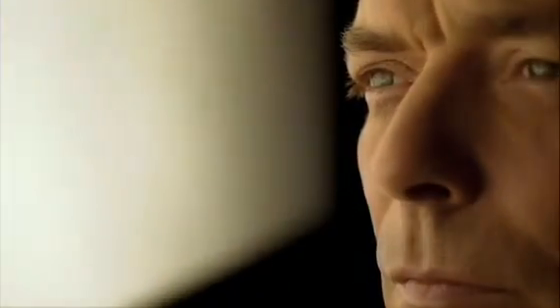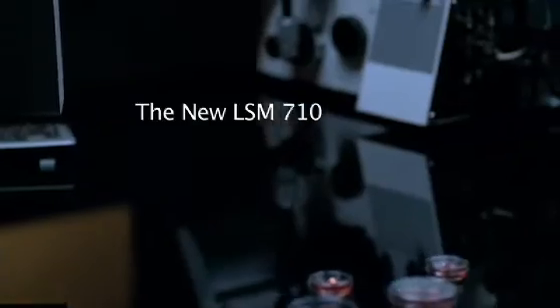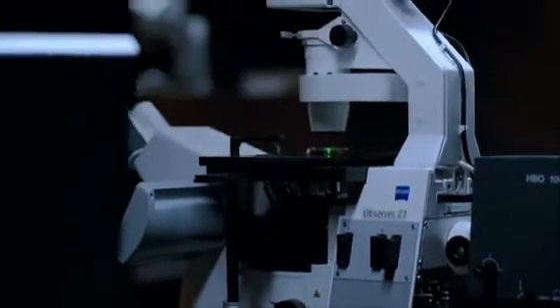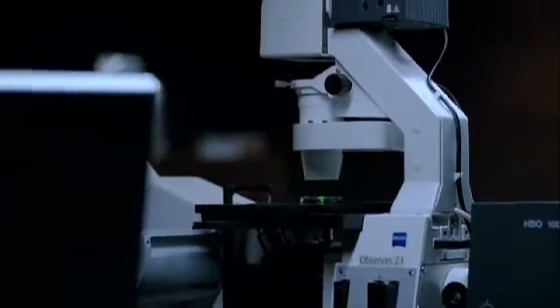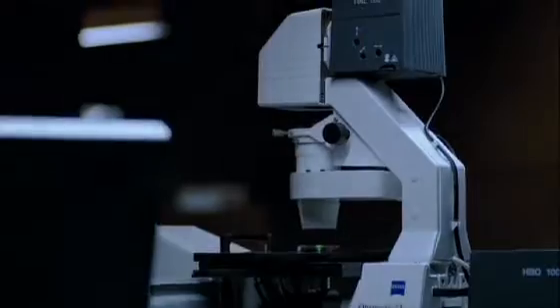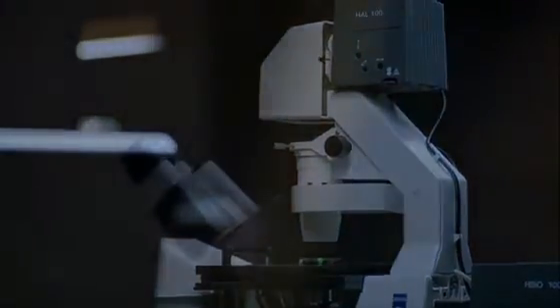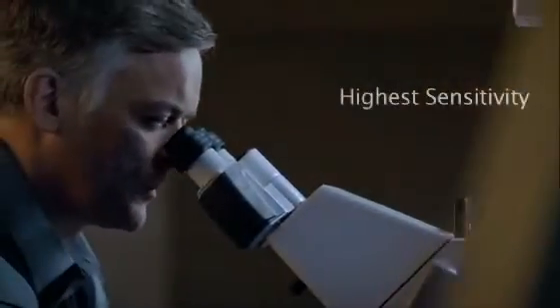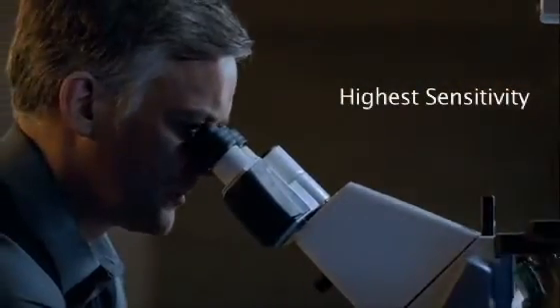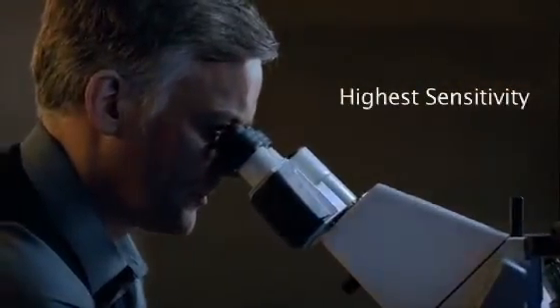Carl Zeiss has pioneered crucial advancements in laser scanning microscopy. The new LSM 710 incorporates all the advantages of existing confocal systems and takes them one step further. Its sensitivity and noise suppression sets a new benchmark so even the weakest signals become visible.